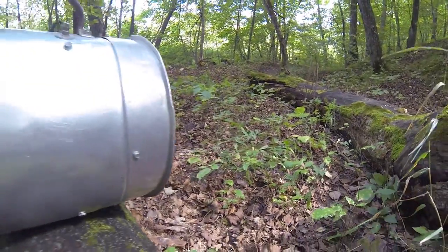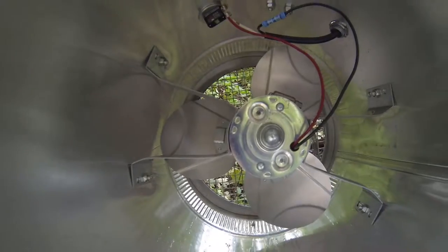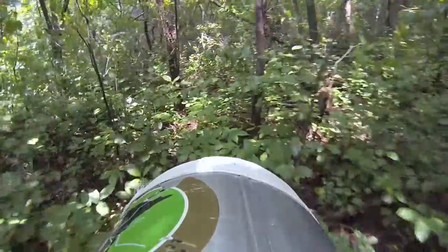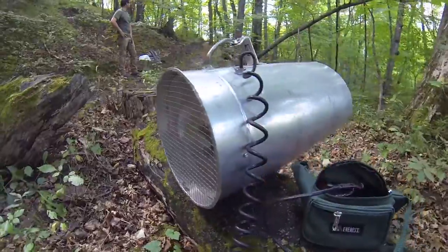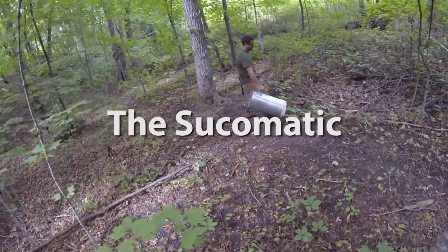It's adapted from a version described by Dr. Roger Nassi of the CDC, and his version was an adaptation of one first designed by Dr. George O'Meara of the Florida Medical Entomology Laboratory. The aspirator designed by MMCD is shorter, lighter, more maneuverable, and uses a smaller, lighter battery than other designs. We call our aspirator the Succ-O-Matic.